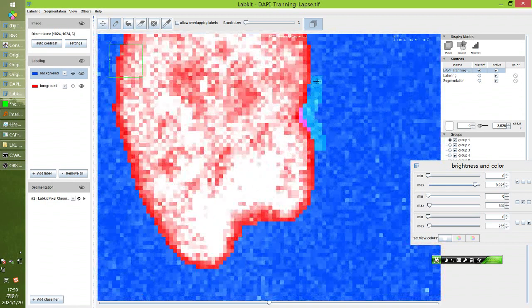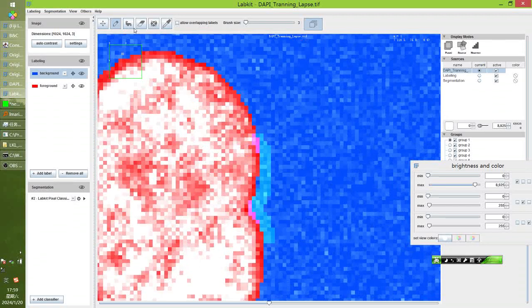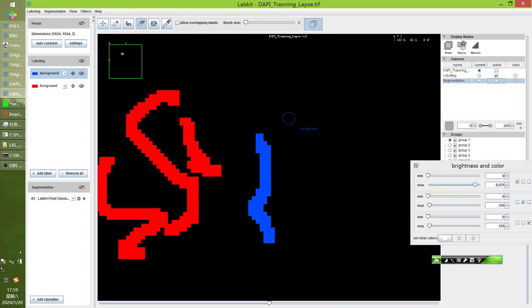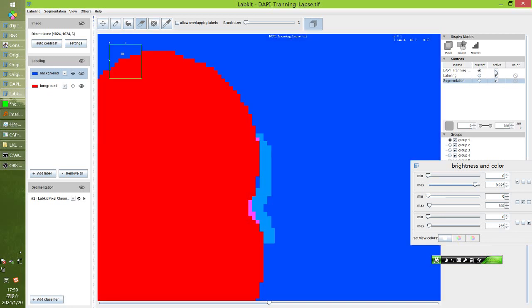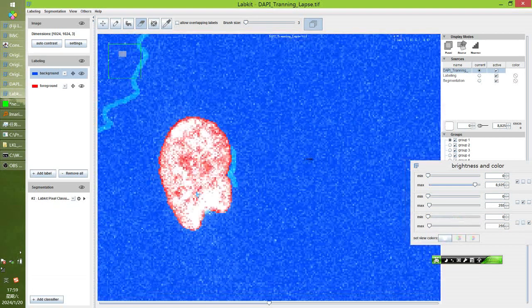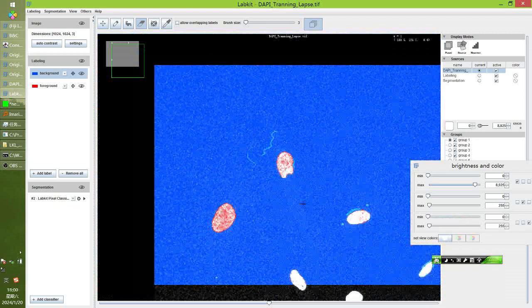Okay, I use eraser to erase this out. If you cannot see it clearly, I can show you the eraser. Erase. Okay, I will retry. Well, now it looks quite good, right?